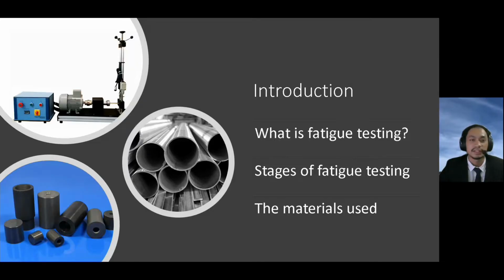So what is fatigue testing? A fatigue test is used to evaluate if a material can sustain cyclic fatigue stress. The material is chosen by design to meet or exceed the service loads expected in fatigue testing application. The fatigue process consists of three stages: initiation, propagation, and final rupture.